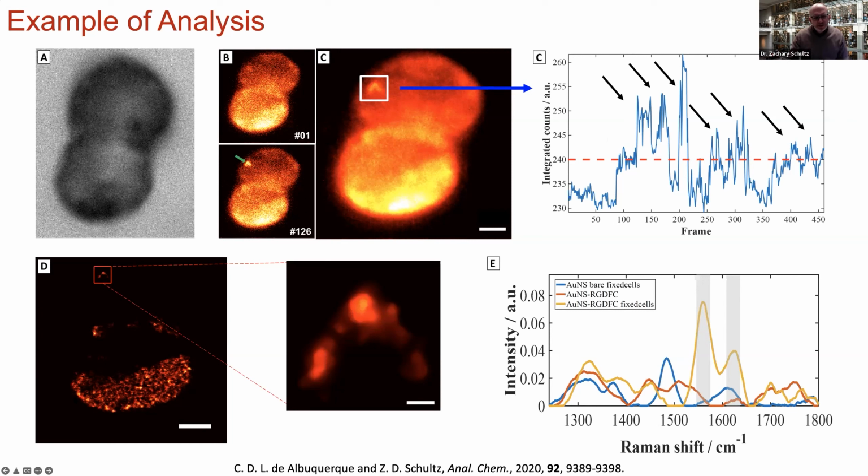When you apply that, you get a bunch of stuff down here that turns out to be background, which we can clean up using some other algorithms. I don't know if I have time to talk about that today or not, but we do see this nanoparticle cluster forming. If we look at this, the scale bar is about 100 nanometers, so this is probably 2 particles or possibly even 3 that are bound pretty close to each other. When we take the Raman spectrum, again we get these bands that are generally characteristic of tryptophan, which suggests it's the same interaction we had been seeing in our prior work with nanostars, doing point imaging as we went through cells.